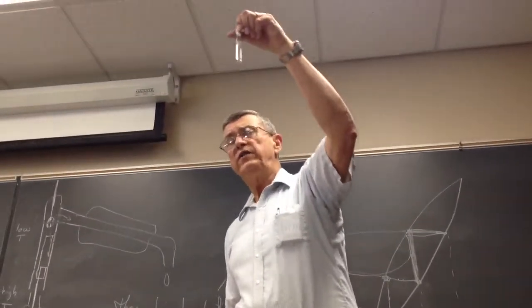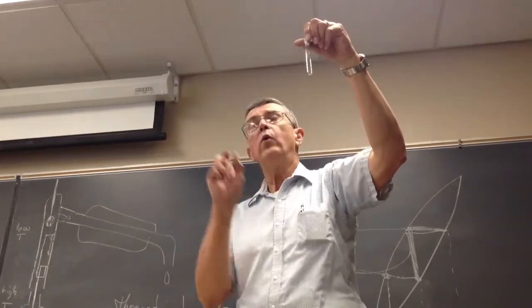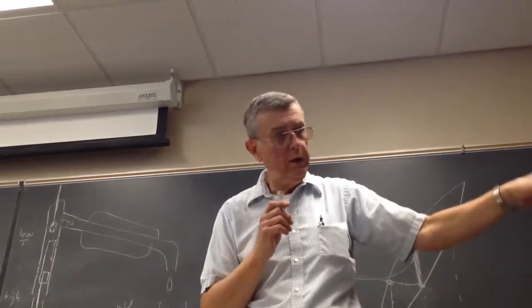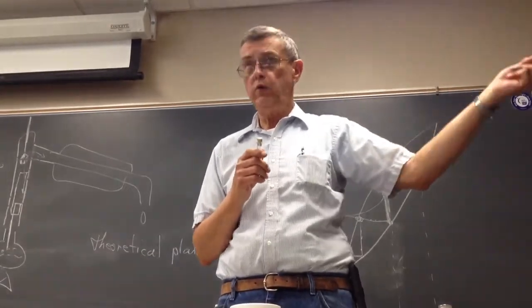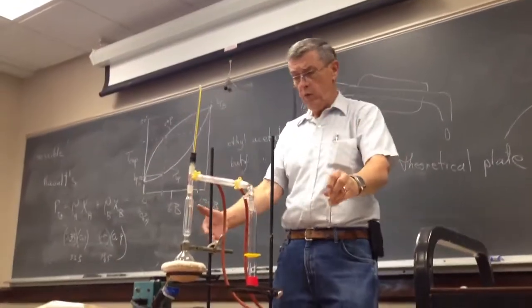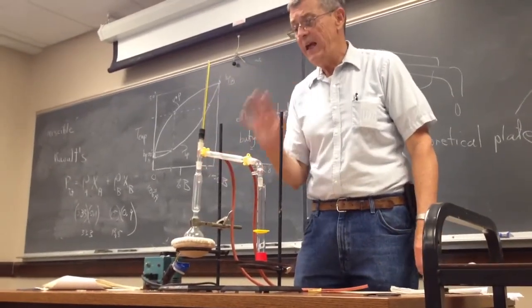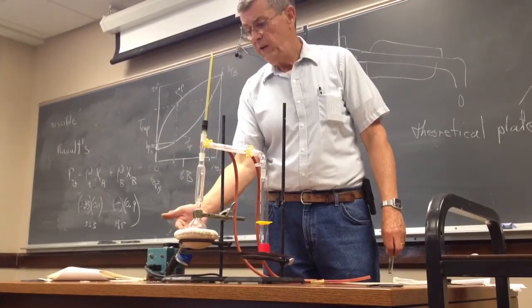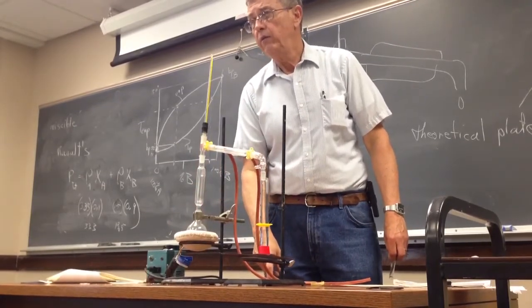You're going to be doing either a simple or a fractional distillation with your partner. Each group is going to do one kind of distillation. So we'll say this hood, you're going to do simple. This hood, you're going to do fractional. And a pair of you will do that type of distillation, whichever it is. This was set up for a fractional distillation. A simple distillation setup is exactly like this, except this isn't here. So this can actually, for that, be a little higher, and that can actually sit on the floor of the hood.